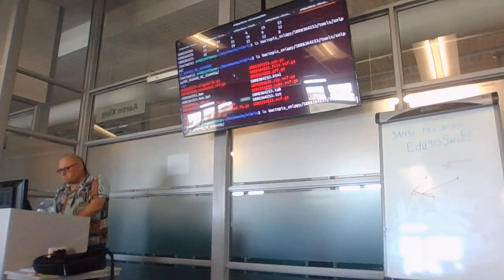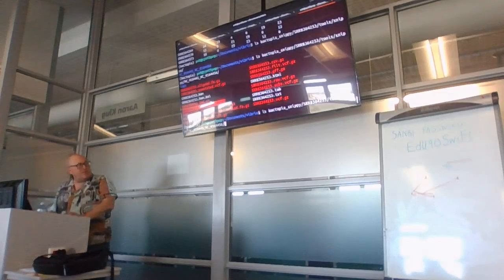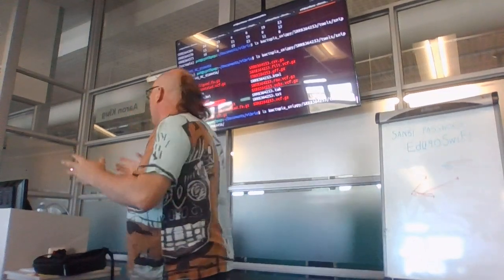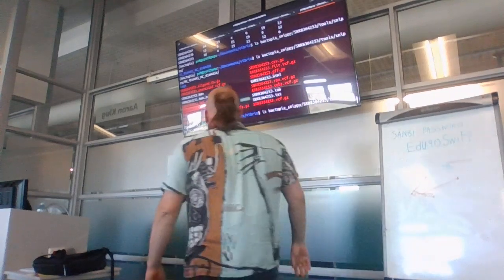So consensus.fa, if we remember from the Snippy documentation, that is the file with all of the variants inserted and things like that, okay?